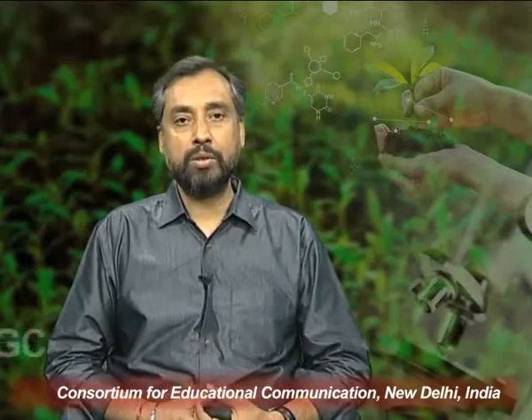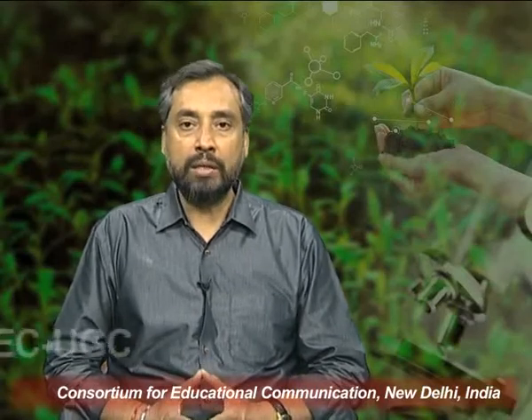STEM contains elements of both transmission electron microscope as well as scanning electron microscope. Like scanning electron microscope, it uses an electron beam that sweeps over the specimen. The image is formed by the electrons transmitted through the specimen, as with transmission electron microscope.